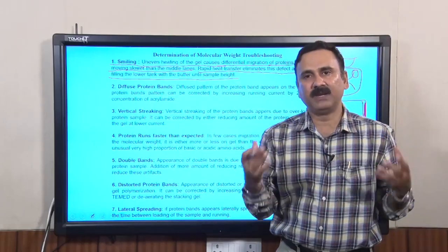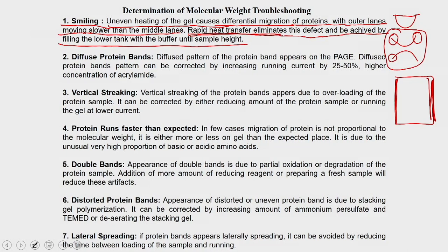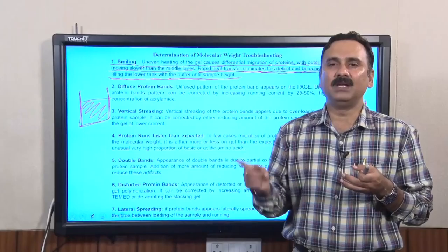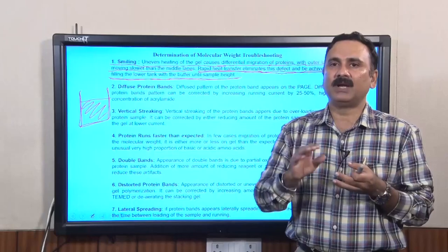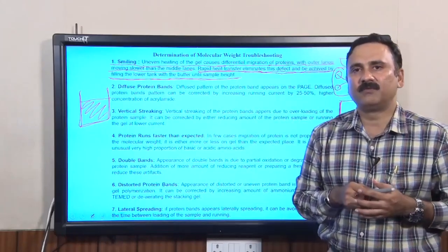To correct smiley bands, maintain cooling in the system by filling the buffer tank slightly more so the buffer maintains uniform heat and keeps the plates cool. You can also recycle or exchange the buffer, or place ice bags around the apparatus if the gel is heating excessively. The second issue is diffuse protein bands, which can be corrected by increasing the running current by 25 to 50 percent or using a higher acrylamide concentration.